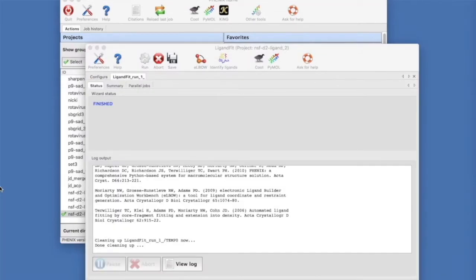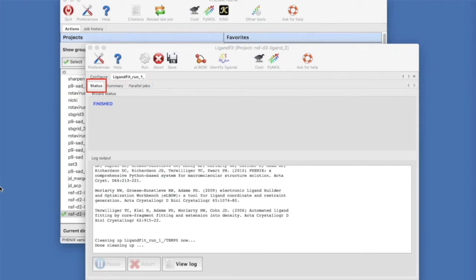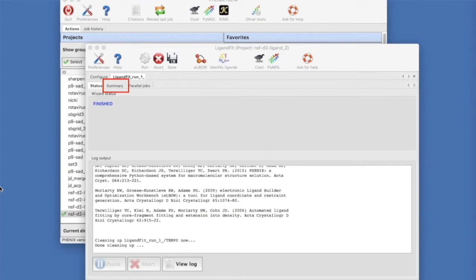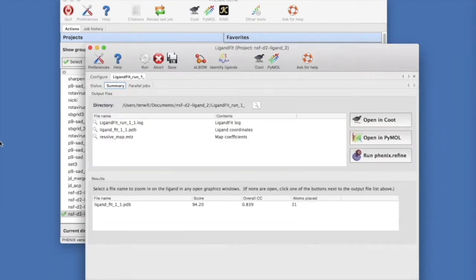Once the GUI runs, a new Ligand Fit tab will appear. The Status tab shows the log file. The Parallel Jobs tab shows the results for each try at fitting. Let's focus on the Summary tab, which shows the files that are produced.